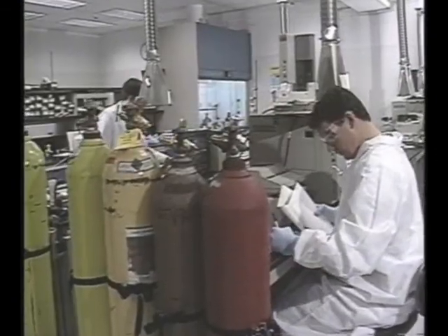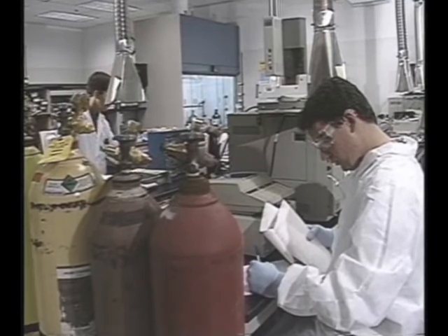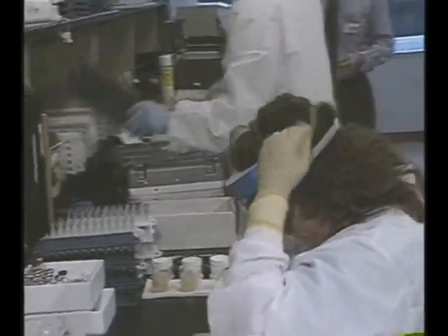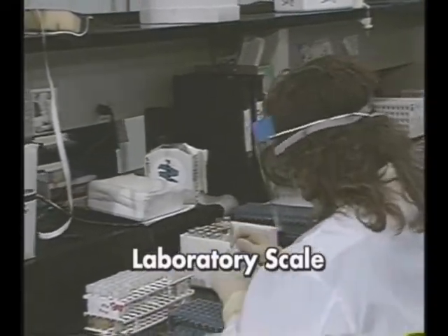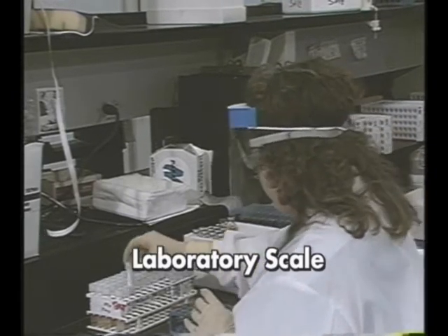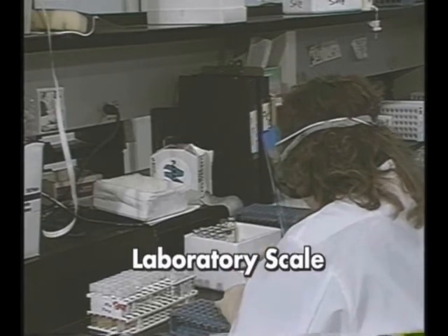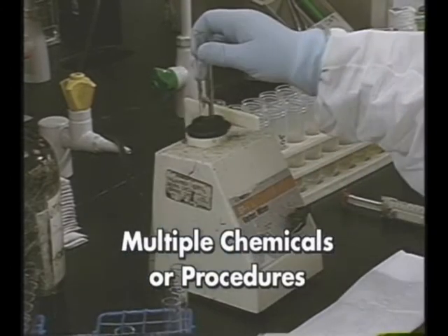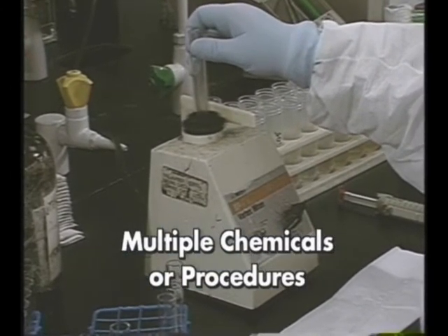But what is a laboratory according to OSHA, and how is it different from other workplaces? First and foremost, in a lab, work with chemicals is carried out on a laboratory scale. This means that the containers used for reactions, transfers, and other handling of chemicals can be used easily and safely by one person. The use of a variety of different chemicals or chemical procedures is also a characteristic of laboratories.